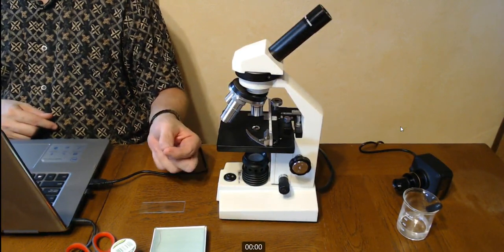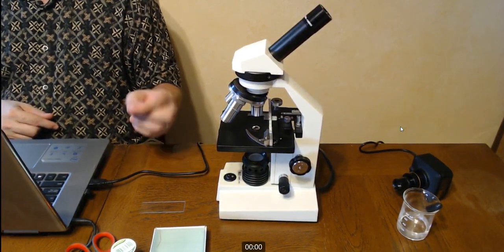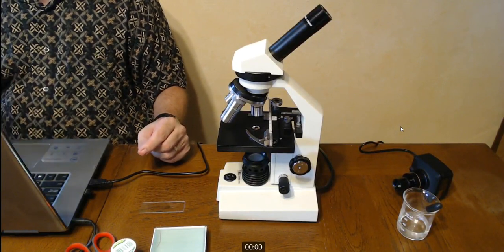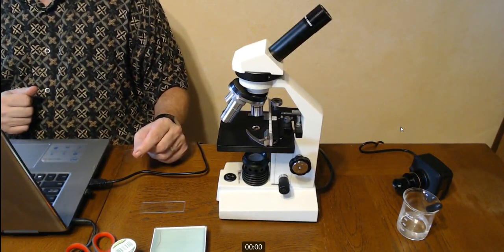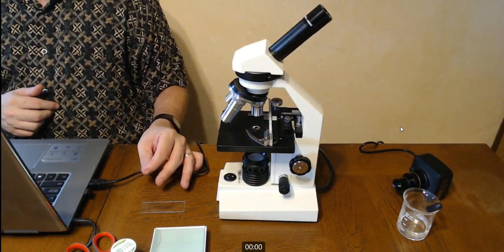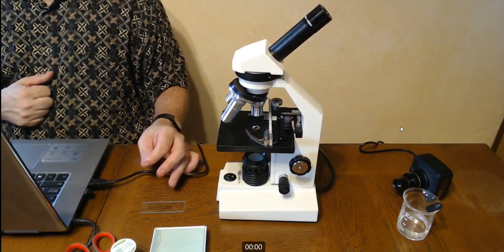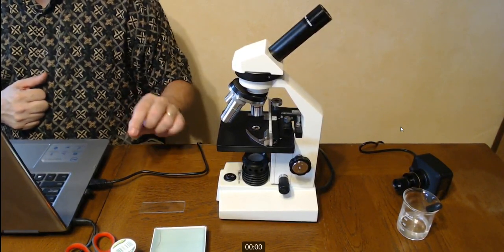When you're cleaning, it won't be too uncommon to break these. If you end up breaking one, just make sure all the pieces end up in the garbage, because the edges can be a little sharp. Neither the slide nor the cover slip are very expensive at all, so don't feel bad if you break one or two. I rarely break slides, but we break cover slips a lot.